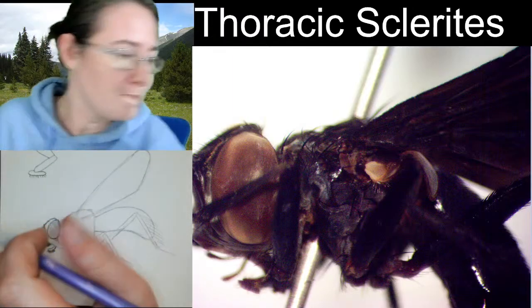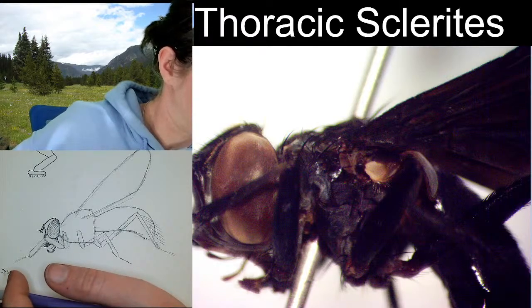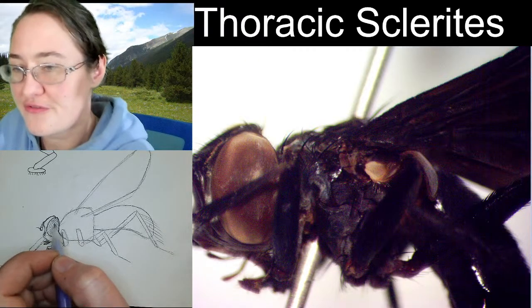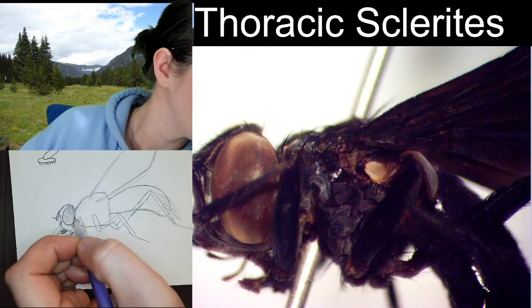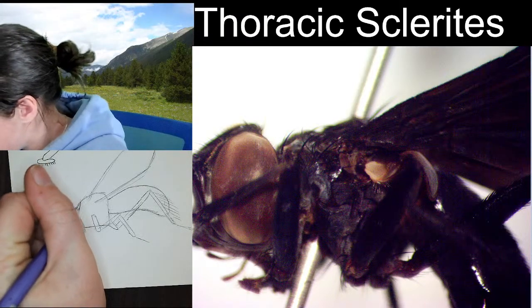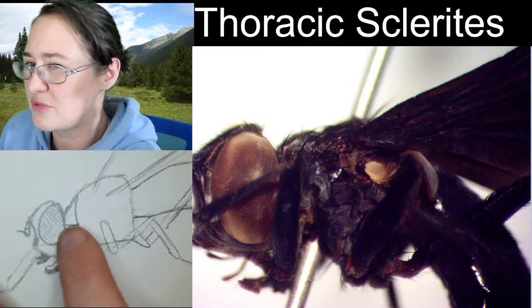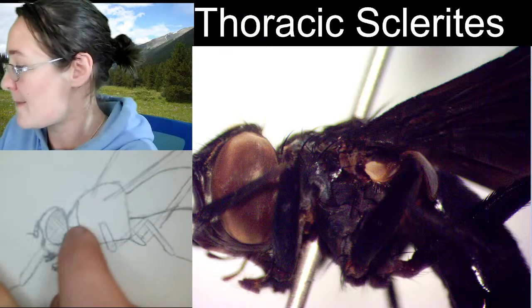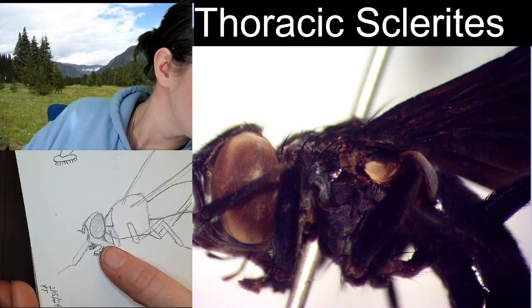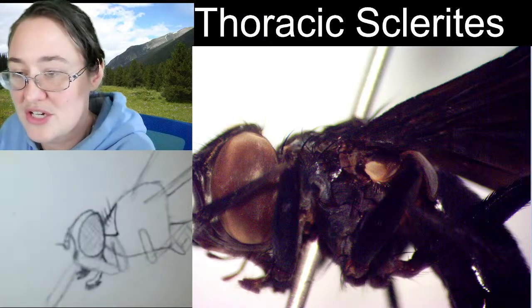All right. The first segment of this fly connects right here to the head, and it comes up about halfway up this hill here, and then comes on down to right around here. So this is essentially the top of the first segment of the thorax, so you could almost consider it the pronotum if it was any other insect, but flies get their own words, so I don't know what we call this sclerite right here. But on that sclerite, there are three distinct bristles that come backwards. And because the bristles are key for identification of these flies, we're going to be drawing them.